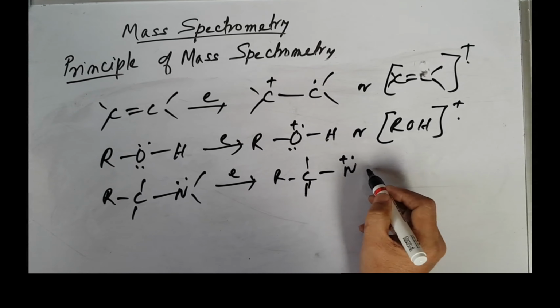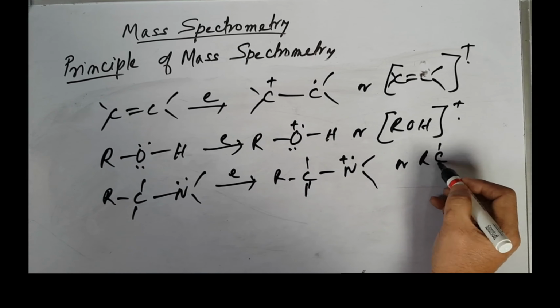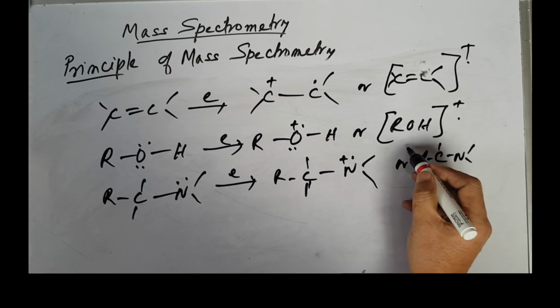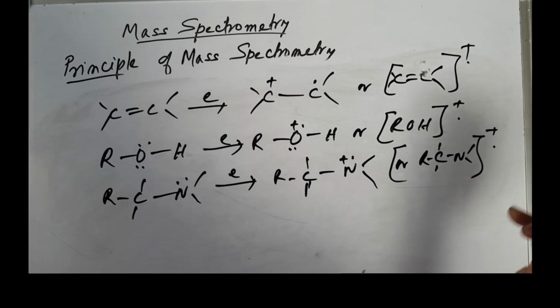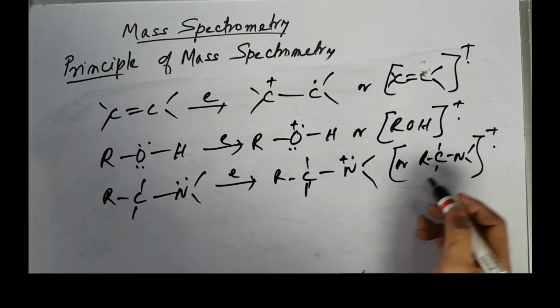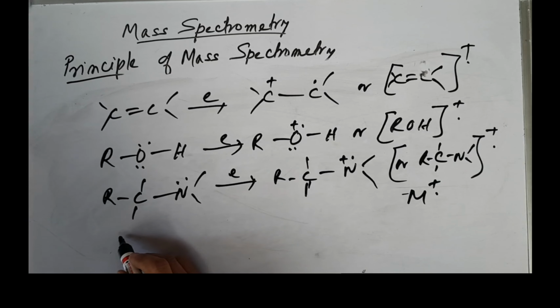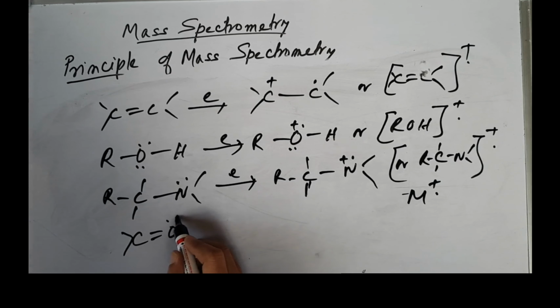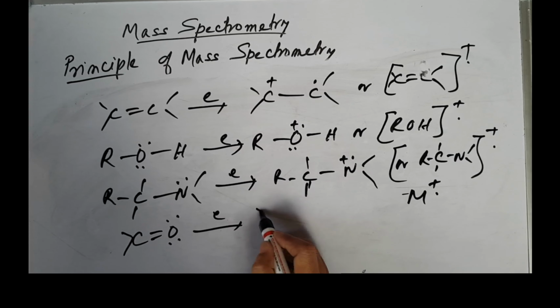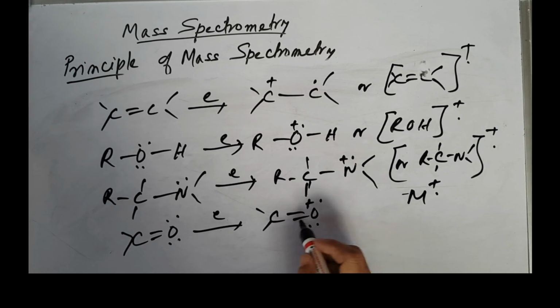Suppose we start here like this, so you can have this one. You can write it this way, R C and so on like this. So these can be represented this way or this way. This you can simply write as molecular ion. Simply represent it like this. So these are all; carbonyl also you can write. You know about one electron, so you can give one electron with this charge here like this. So this can also be given this way, or you can have it given this way also.